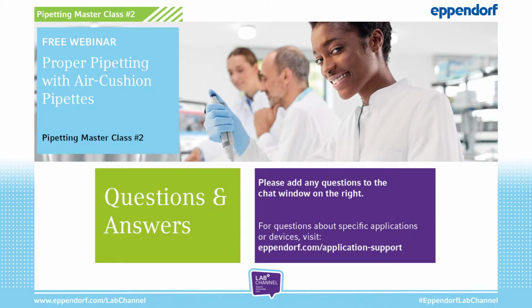So first of all, when you are using an air cushion pipette with viscous liquids, take a closer look at the immersion depth. Especially when pipetting viscous liquids, many persons make something like a deep dive into the liquid. But as I also mentioned, the ISO says that you should adapt the immersion depths. However, it's quite difficult. So just check to immerse the tip as little as possible without taking up air.